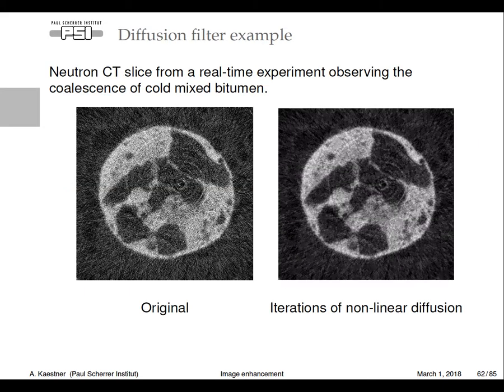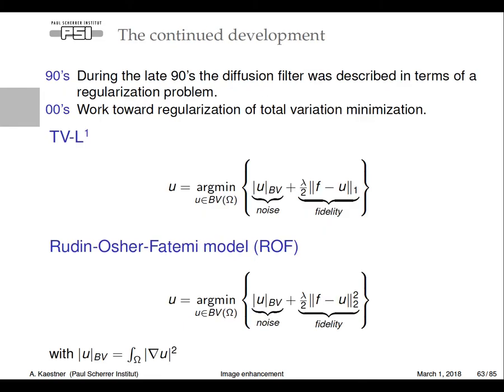And here again, we see the same example. And you can see the filter effect is improving. So you see the filter steps. You may see it better on your own screen, possibly. But it's doing a pretty good job now. Then people were not happy with the performance of these filters. They have some drawbacks. They may be a little bit not smoothing good enough, or they have some problems around some edges, etc.